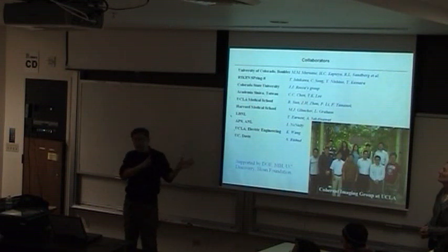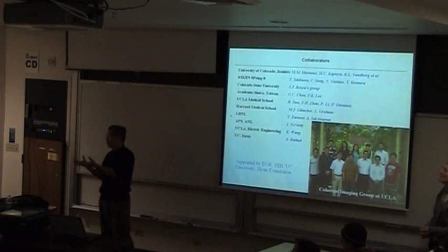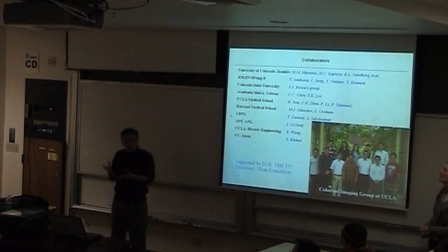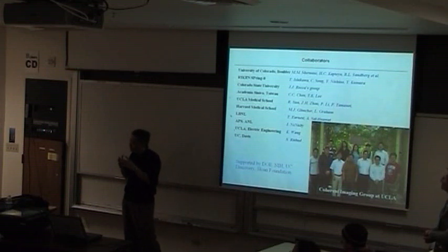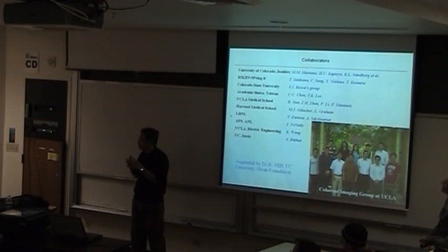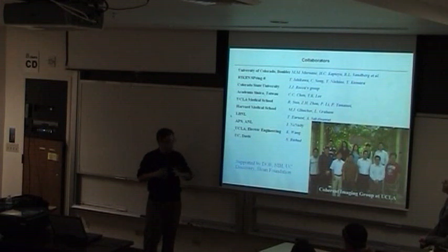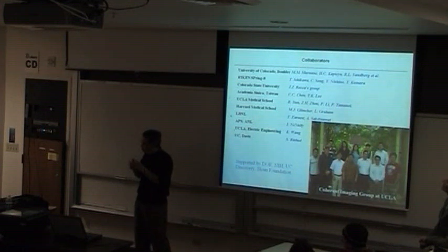So that's kind of related. Coming back to your question, for biological samples, radiation damage is a major issue. There are two ways to try to reduce radiation damage. One is to freeze the sample at liquid nitrogen temperature, and we're going to pursue that direction. Just maintain a very low temperature, and that can reduce the radiation damage a lot.